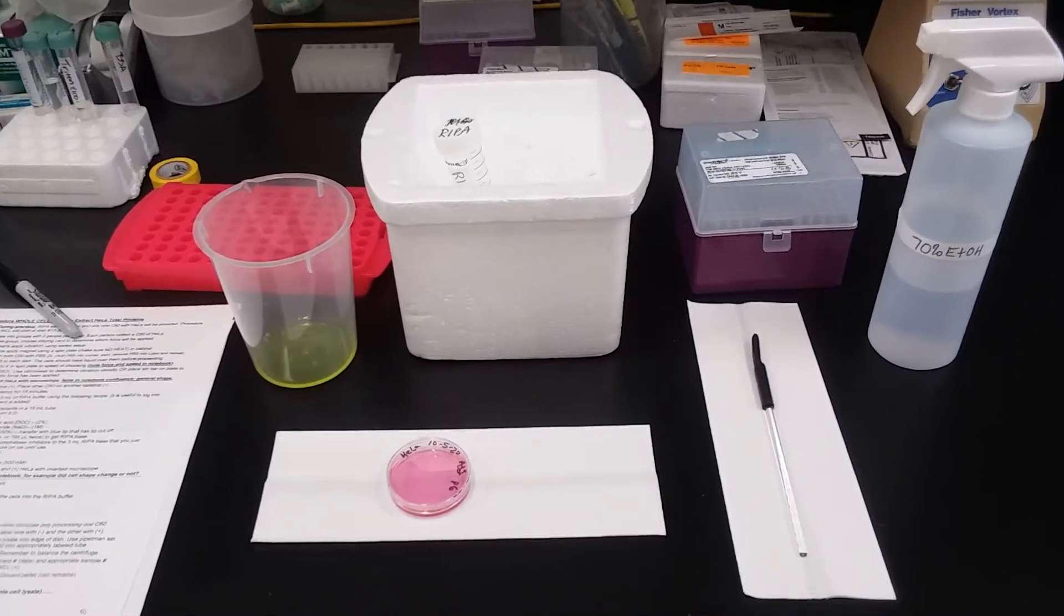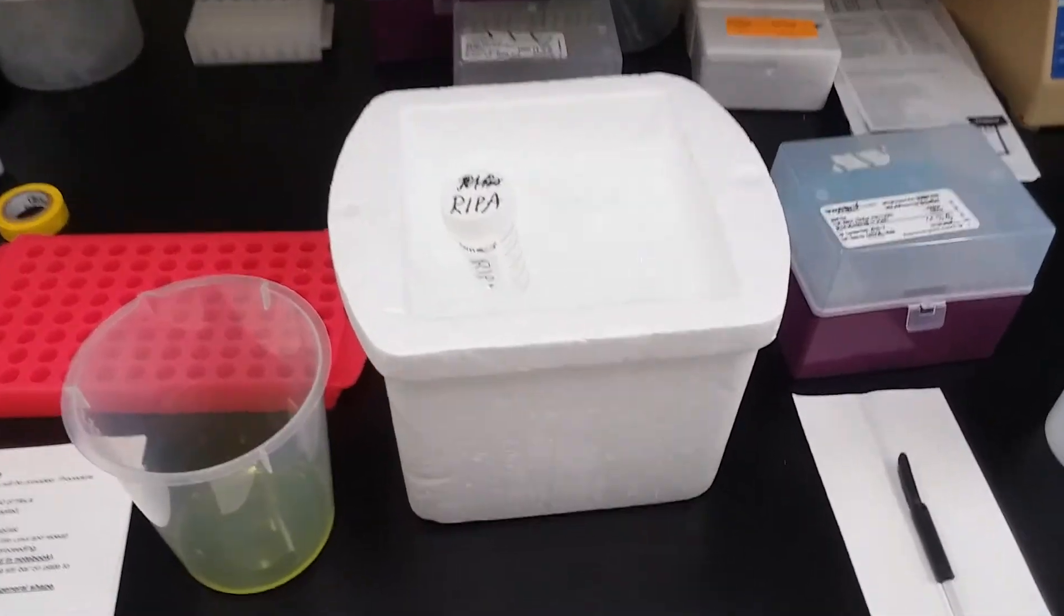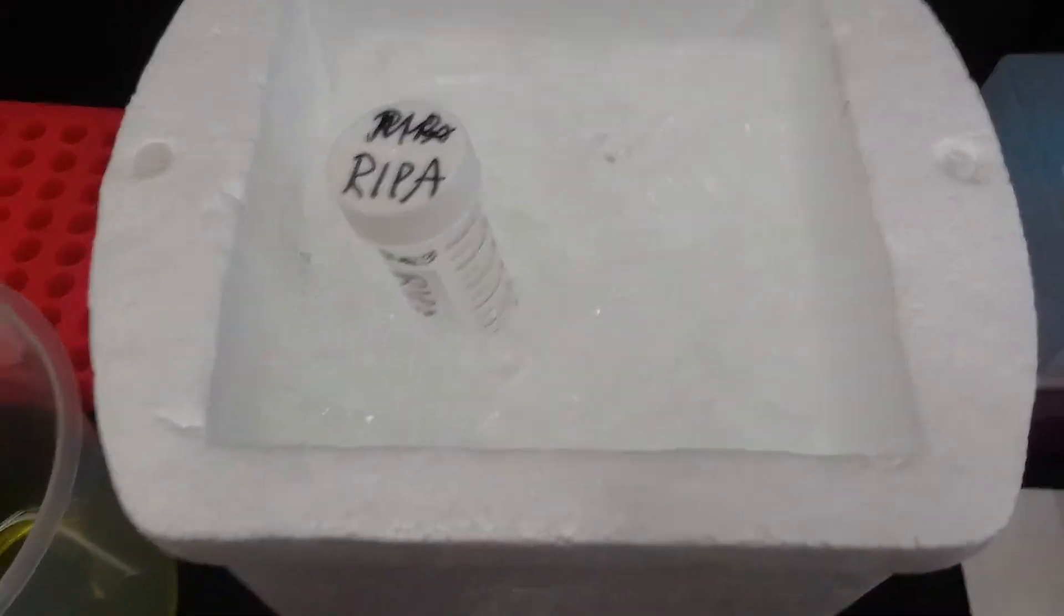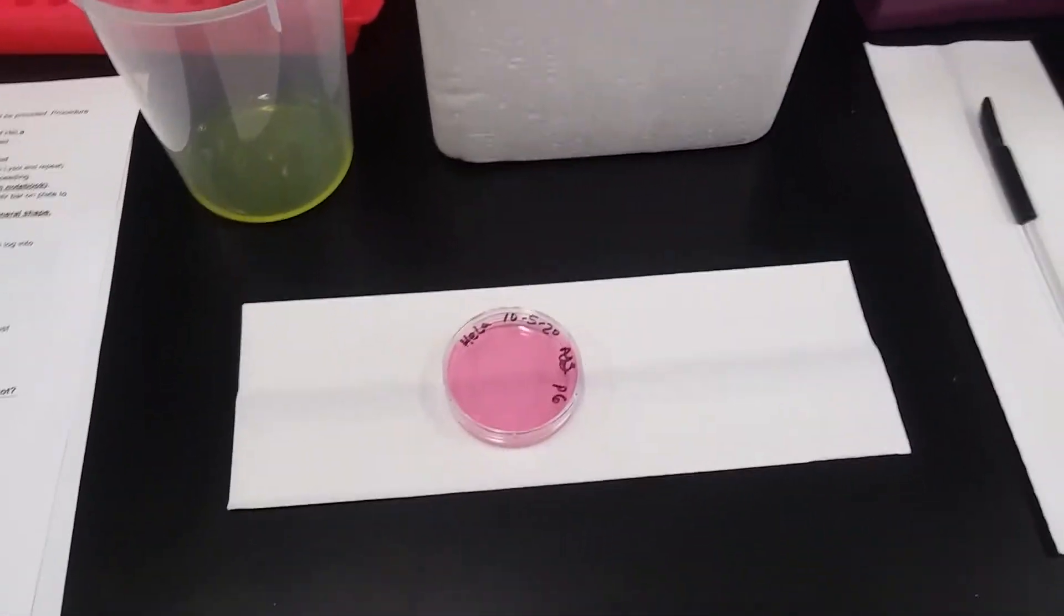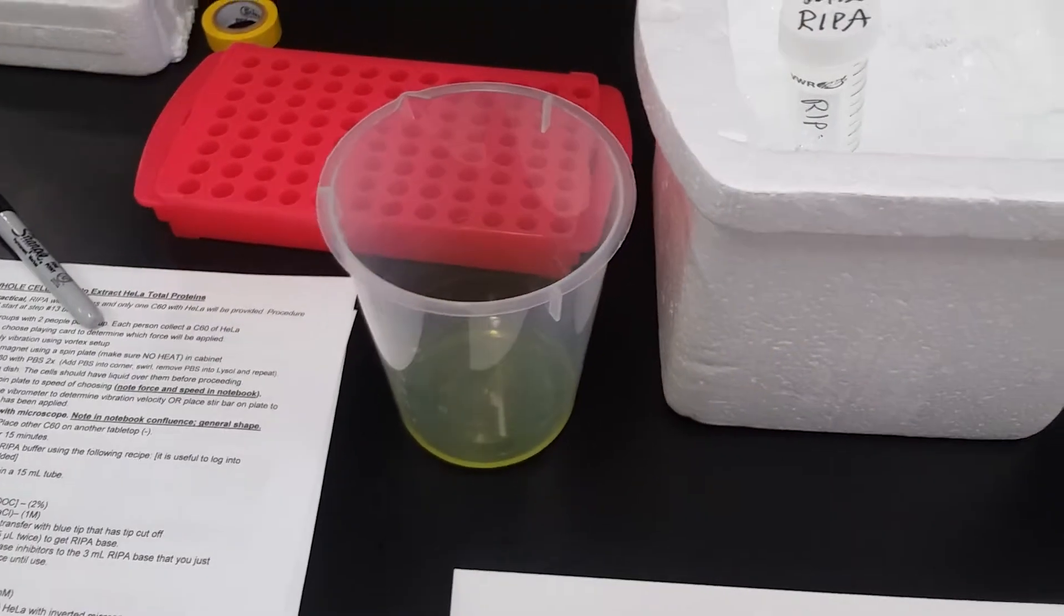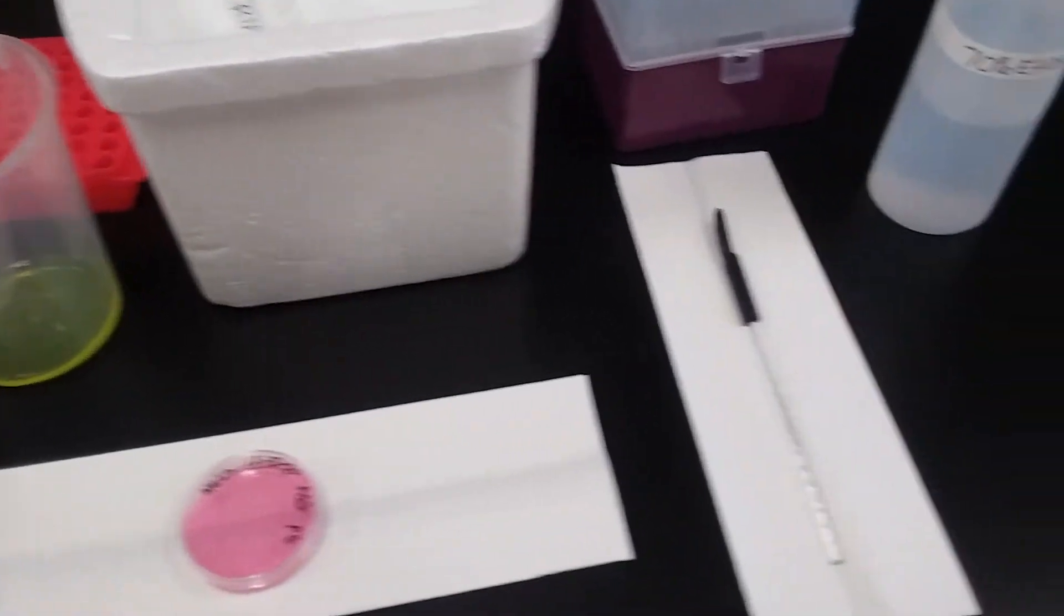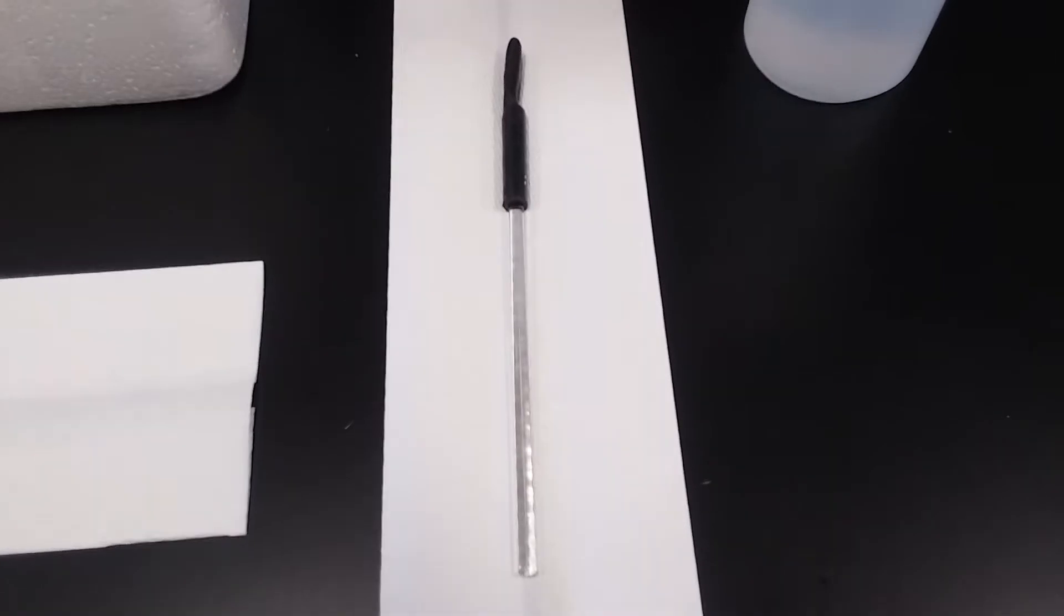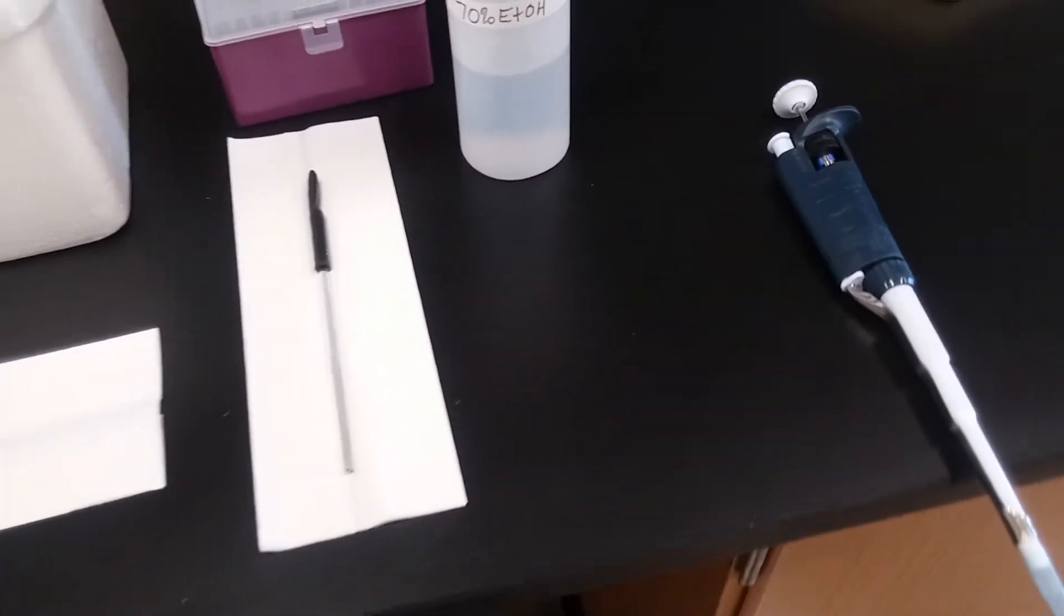So I've cleaned up my area, and now I'm ready for my actual lysis. I have my super cold RIPA, my C60 of HeLa, a beaker with Lysol in it. I also have something called a rubber policeman, and I have my pipette man set with my tip, and I'm ready for lysis.